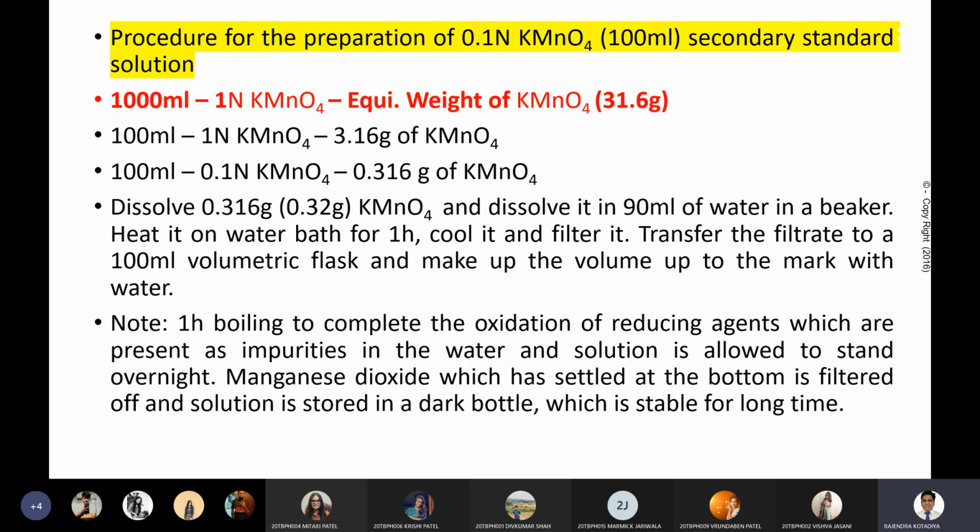ઓકે, સો લાસ્ટમાં I will get the pure form of KMnO4 solution, and that we need to keep it in dark bottle, because in presence of light KMnO4 solution no be decomposition થાય છે. So this KMnO4 solution is very critically prepared. જ્યારે તમે એને actual practical કરશો ને ત્યારે તમને idea આવશે કે શું થઈ શકે છે.